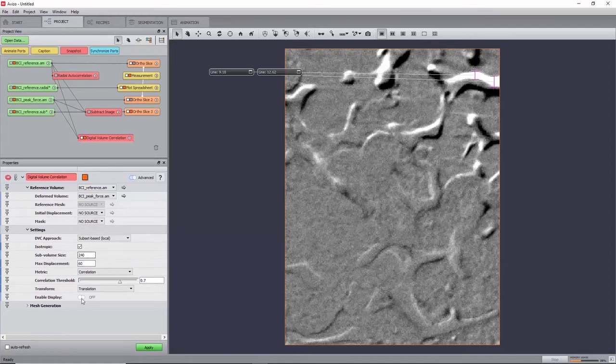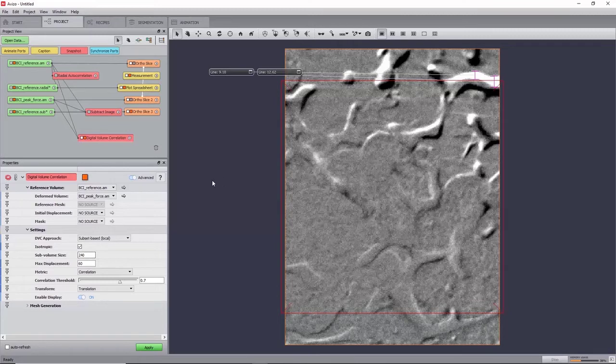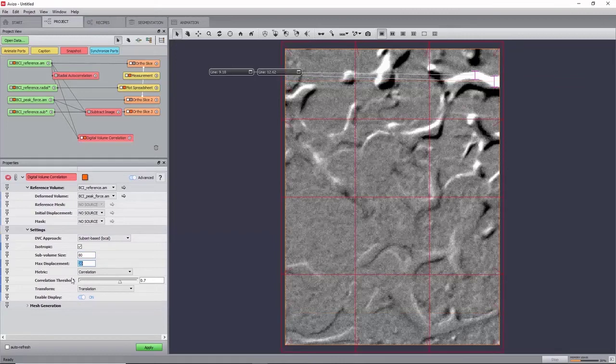And then set the port Enable Display to ON. Using the previous measurement of the characteristic length, we can set the sub-volume size to 80 for initializing, and adjust the maximum displacement to 12 voxels.